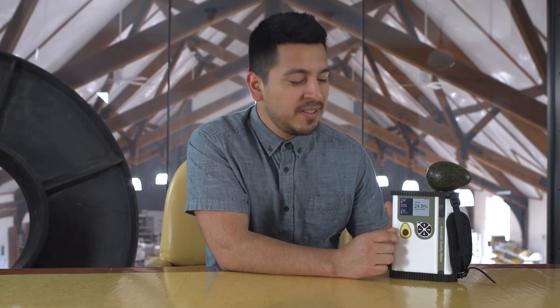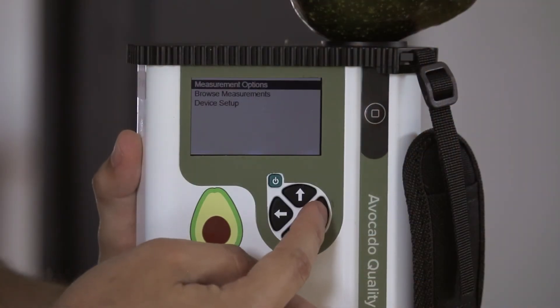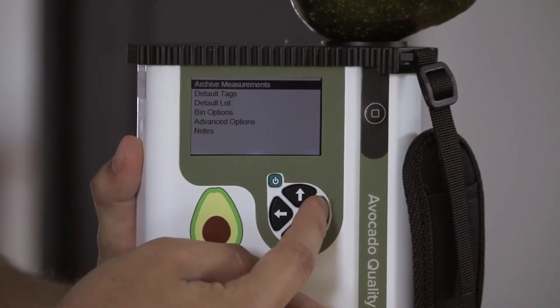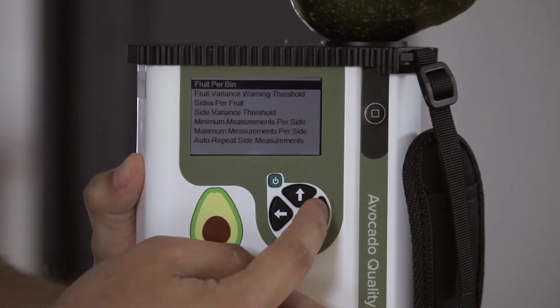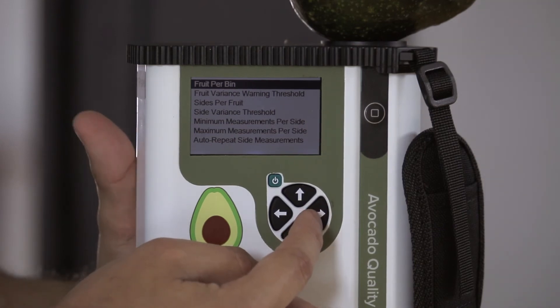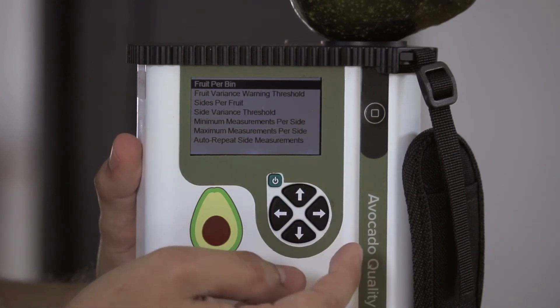Now let's talk about the display in more detail. By default, the device is programmed to take two measurements per avocado and five avocados per lot. However, these options can be customized to user preference by pushing the right arrow to navigate to the measurement options. Then navigate to bin options. Within this menu, you are able to set the number of avocados per lot and the number of measurements per avocado, as well as other functions described in the manual.